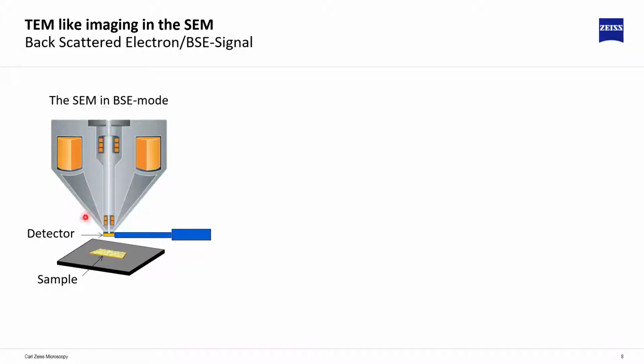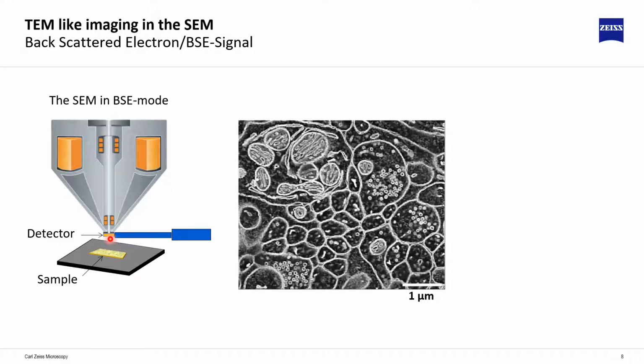The electron beam comes down the column and eventually hits the sample. And this could be, for example, a section sitting on a silicon wafer. This beam eventually scans over the surface, and the detector right here, in between the column and the sample, detects all those electrons that are emitted by the beam interaction. And while we're doing that and scanning over an area, we create an image like that.